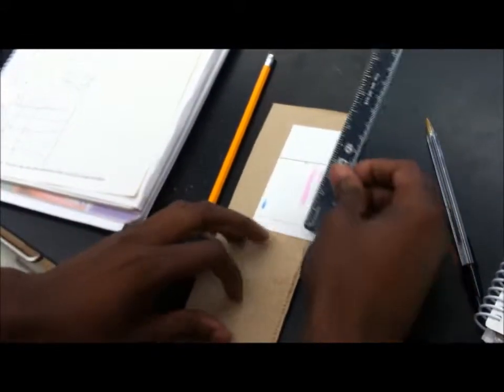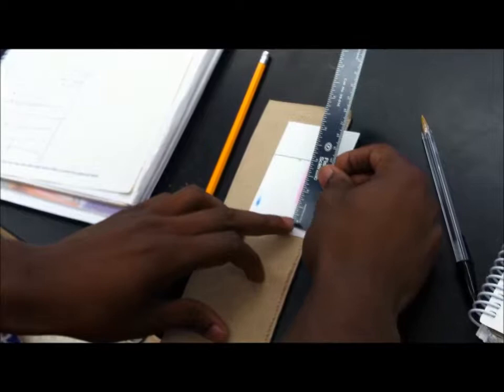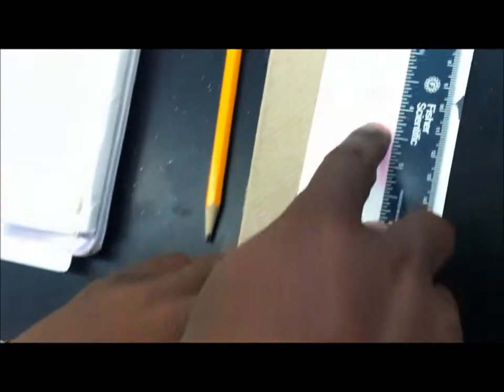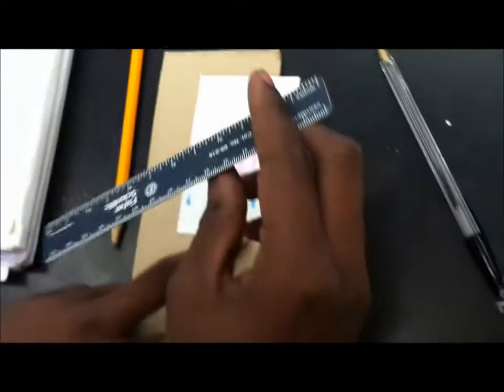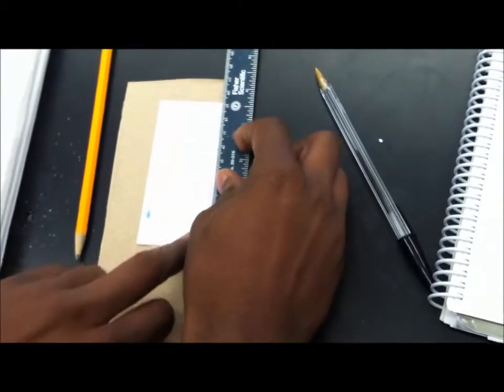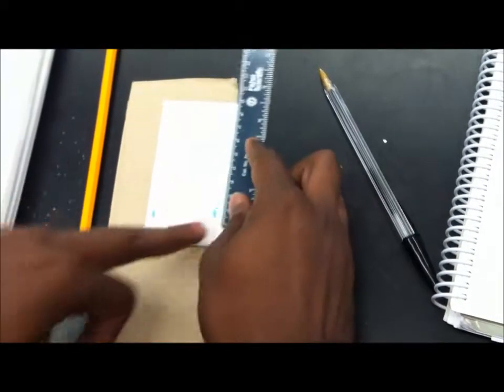All right, and for this one, we're going to measure that right there. And that happens to be our methyl red. And we're going to start it from here and we're going to go up about there. And you can see the dot is right here. It's not the drip that is right here. So we're going to say that that is about 4.8.